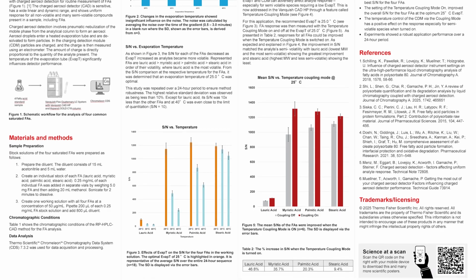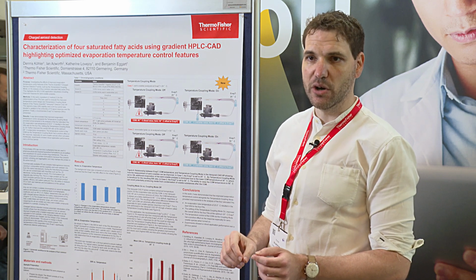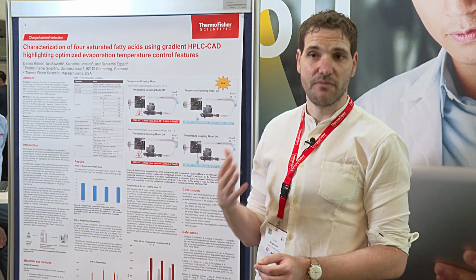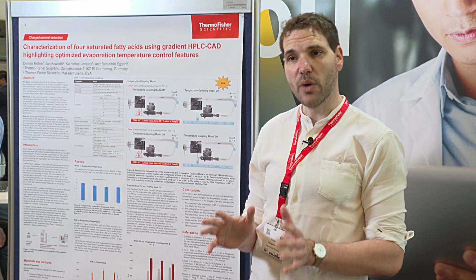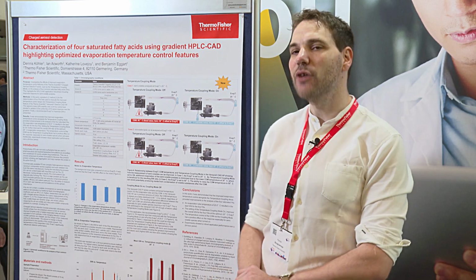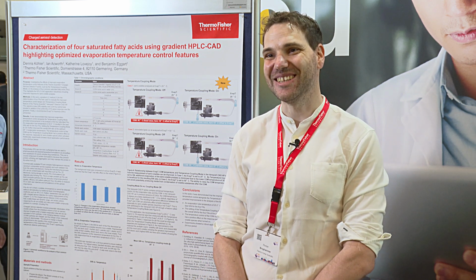If the evaporation tube is at 50 degrees, the customer can decide, is it +1, +2, +3, +4, +5? The increment is 1 degree, and then he can couple the CDM and say, okay, I'm coming in with 50 degrees, so this CDM is 51, 52, 54 degrees, etc. And that gets him way closer to the temperature of the evaporation tube. So to come back to your question, this was a bit long, but what we wanted to showcase is how useful this is for our customers, give them a preview of this tool and advertise it to them. And that's basically what we did, yes.